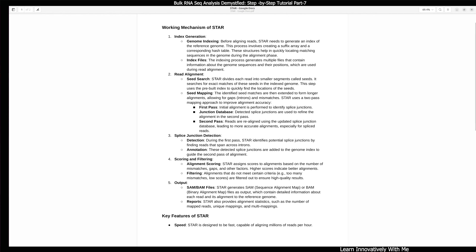The next step is read alignment, which is a very different approach from other aligners. Here you can see the seed search, in which STAR divides each read into smaller segments called seeds. It searches for exact matches of these seeds in the indexed genome. This step uses the pre-built index to quickly find the location of the seeds.